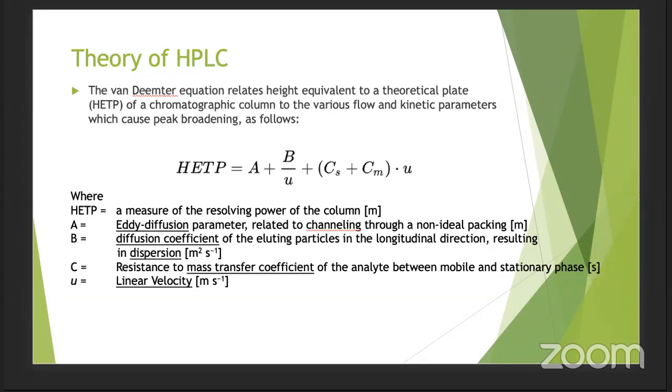Now, peak broadening, as in when the component starts to elute from, say, first second your component starts to elute. So it will take some time to elute that component completely, and because of which there is peak broadening. It does not come out in a sharp peak. So that is eddy's diffusion or multipath effect.